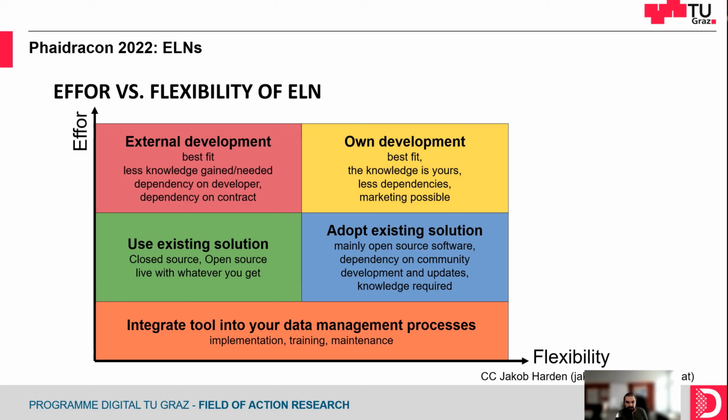And there are differences between these solutions, because there is not one ELN out there. There are different styles of ELNs, and all of them have different areas where they fit best. And with this chart, you can see that it doesn't matter which ELN you use.